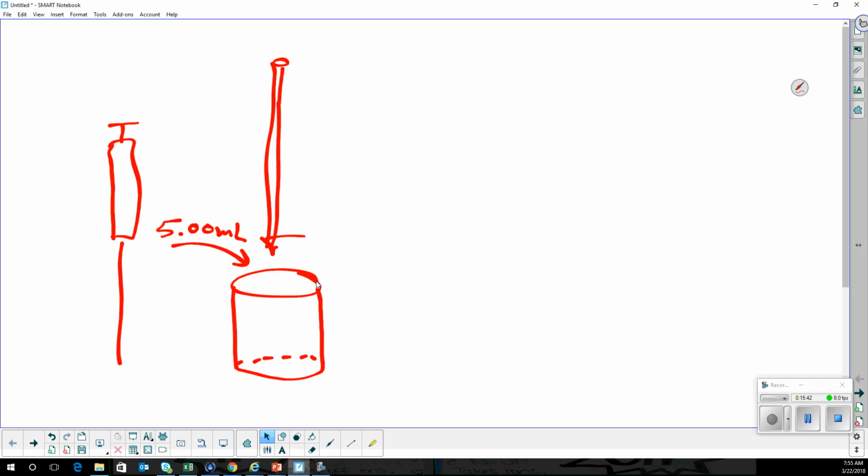All right? Okay, you're going to titrate it like normal, really fast, quick. Then you're going to do one with the pH probe and the calculators. Anybody remember the program? Easy Data. And what do you do once you get into Easy Data? First you go to Set Up, then Events with Entry, right? And then you're going to go Start. Please don't forget to push Start. Okay, and remember you have to hold the Keep button until it comes up to where you put the number in. And then go on to the next one. And all the things are the hotkeys underneath. Then you'll come in here and you'll print it.